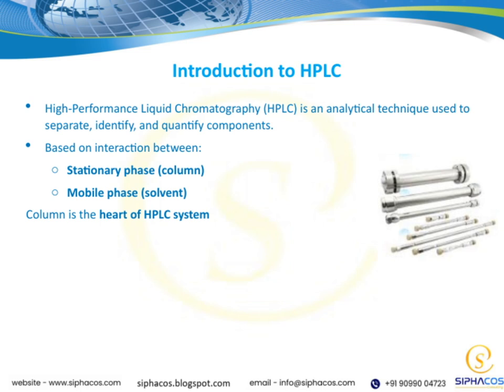The column itself is the heart of the HPLC system. It's where the actual separation occurs. Everything hinges on how well this column performs, making its quality and design crucial for accurate results. As we move through this presentation, keep in mind that understanding these interactions and the role of the column will help us grasp how HPLC achieves such precise separation and analysis.